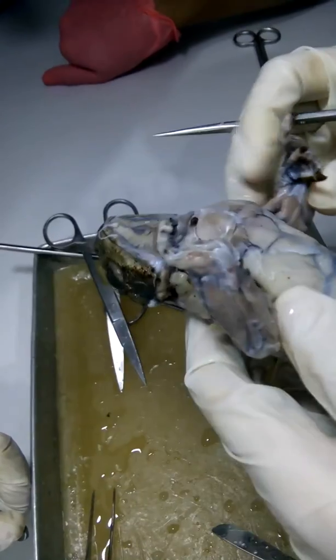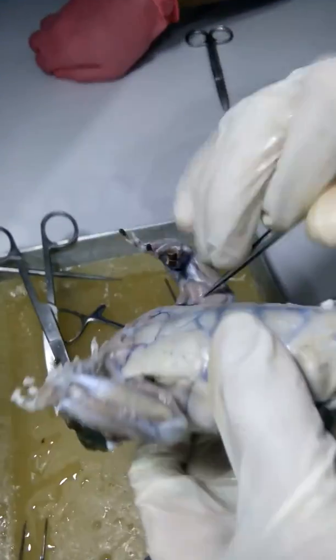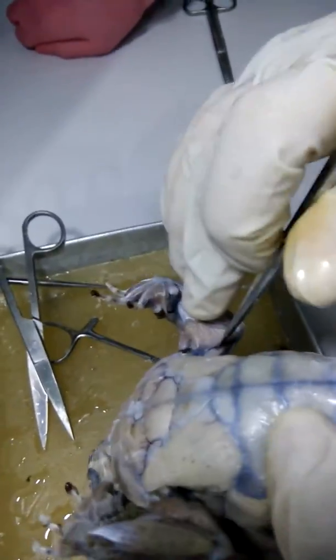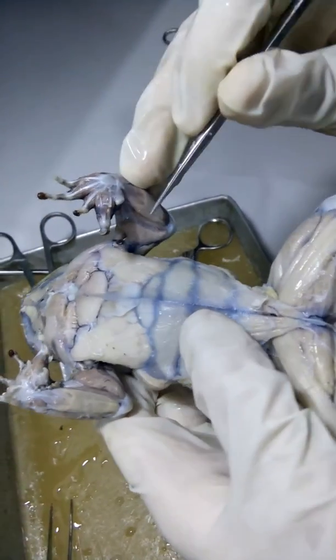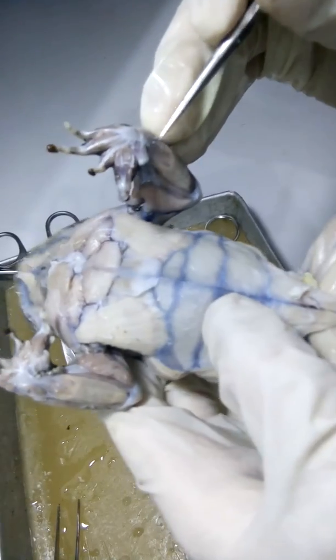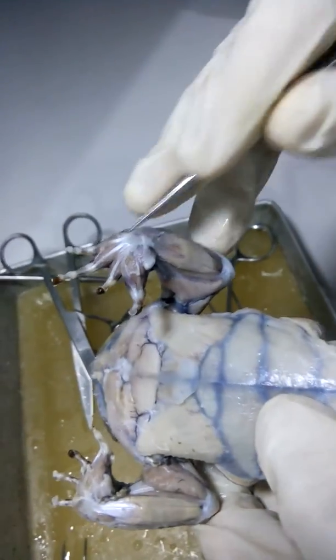So now let's move on. The forelimb is made up of your major muscles, which is your triceps brachii. It's triceps because tulo. So this would be 1, 2, and then 3. So triceps brachii. And then you study na katong mga flexor radiale, flexor. So this right here will be flexor palmare because of its association with the palm.